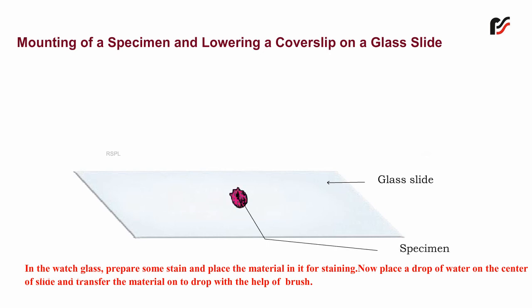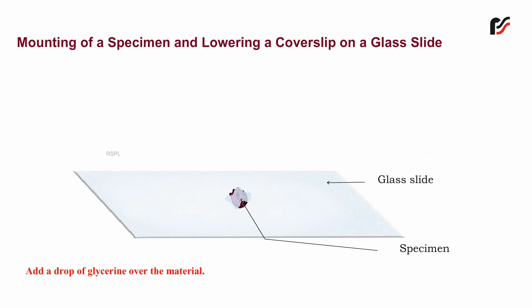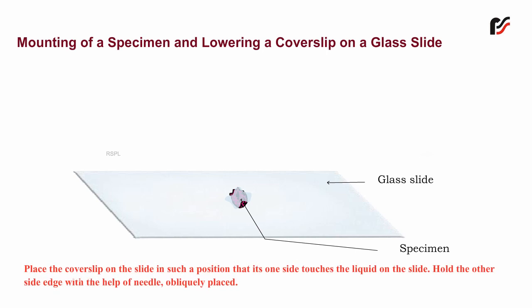Add a drop of glycerin over the material. Place the cover slip on the slide in such a position that its one side touches the liquid on the slide.